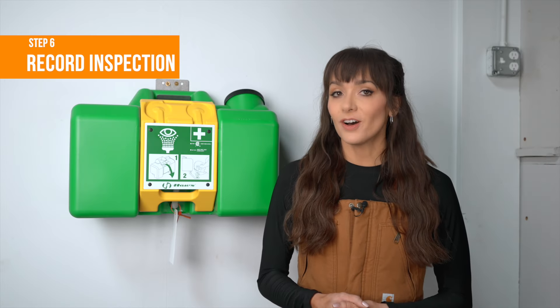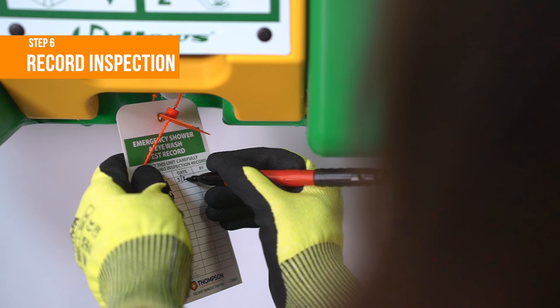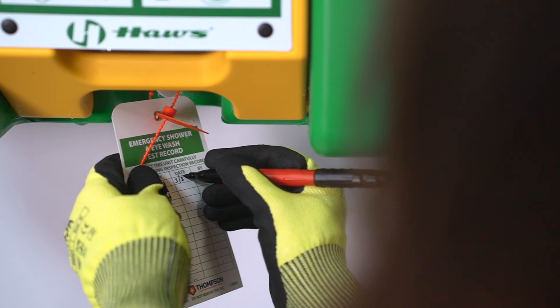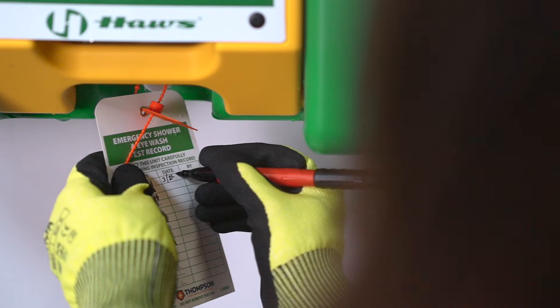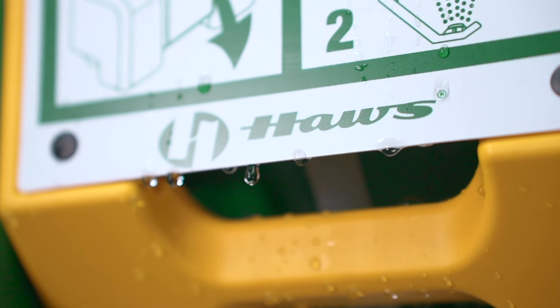Step 6: once all issues are resolved, document the inspection on the unit's inspection tag. If there's any maintenance needed, follow the manufacturer's recommendations for maintenance, including cleaning, refilling, and replacing parts as needed.